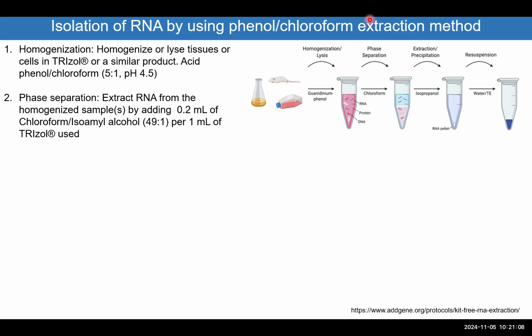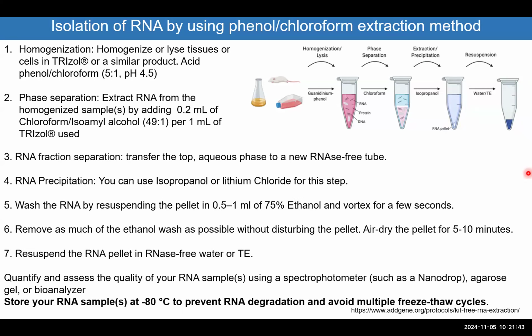And then you will do a separation of the aqueous phase, where mostly RNA is there, and a very small amount of proteins or DNA can be found. Take very good care when you are separating this phase. You don't go to zero, you leave a little bit here, so that you don't take anything from the interface or the lower part. And then we will add isopropanol, and that will cause the RNA to precipitate. If you centrifuge that, you will get the pellets. You get rid of the supernatant, and then you will have your RNA in the tube. So it's very easy.